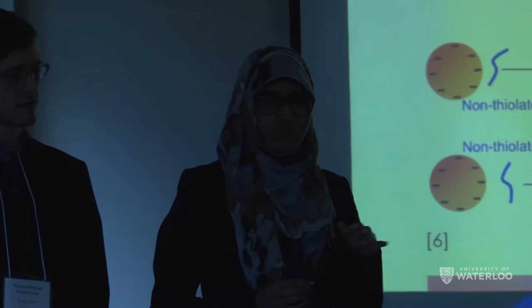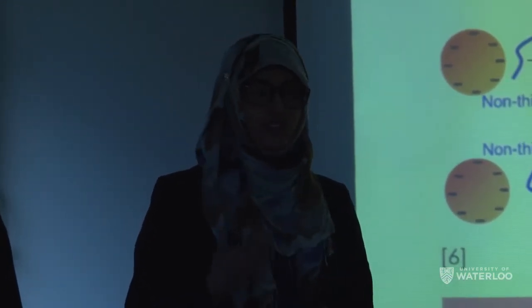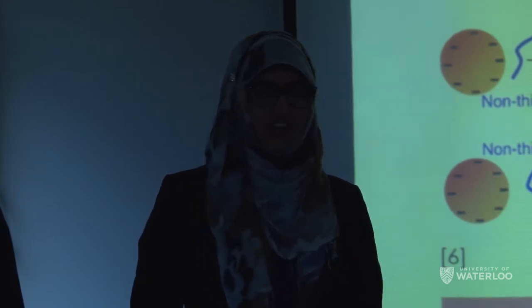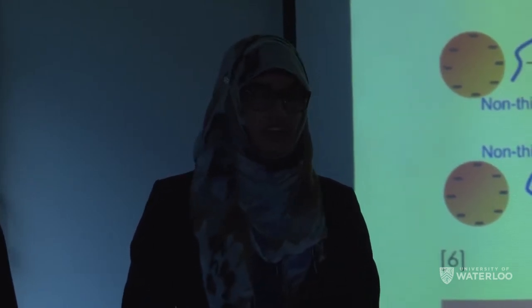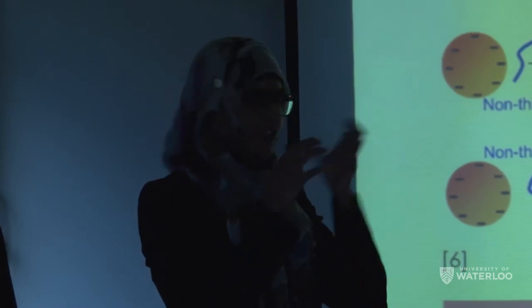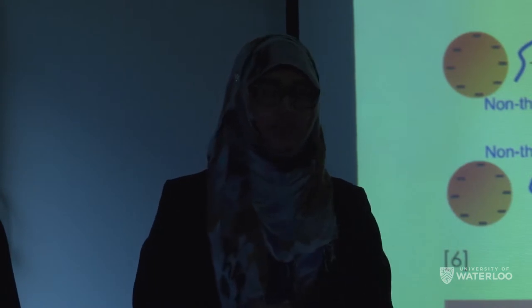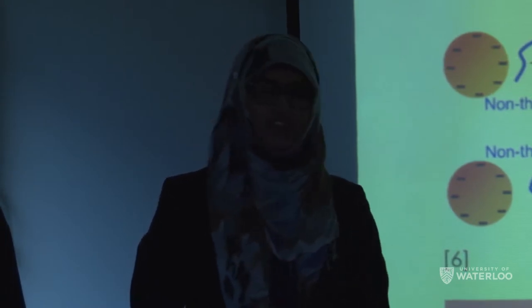Now in the next part of the picture, you can see that with the same conditions, pH 7.6 and NaCl, if you use non-thiolated DNA, you don't get a very good surface coverage. All the DNA is kind of wrapped onto the gold nanoparticle. You don't get a lot of free space so that the gluten or any target is able to bind. So this kind of renders our sensor inoperable.